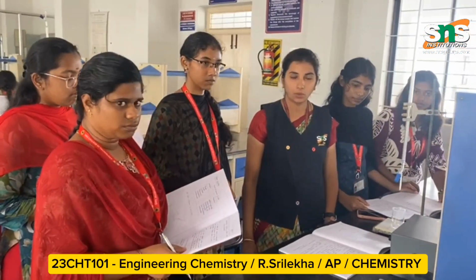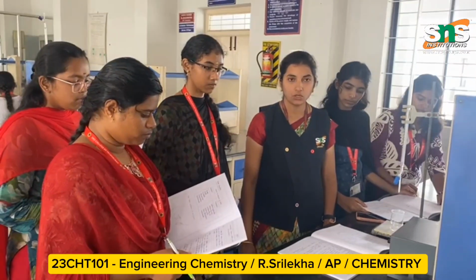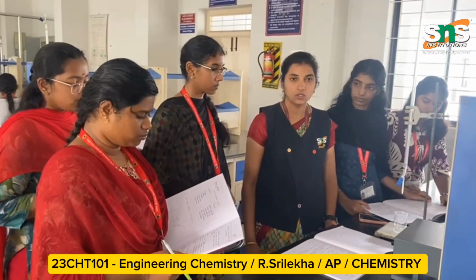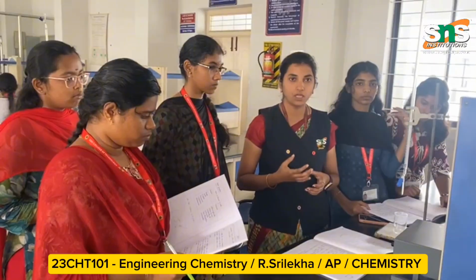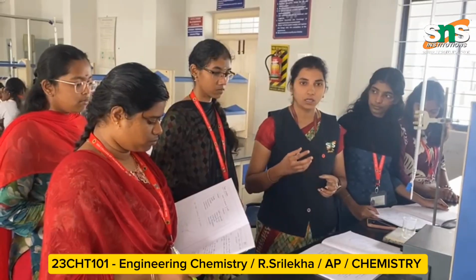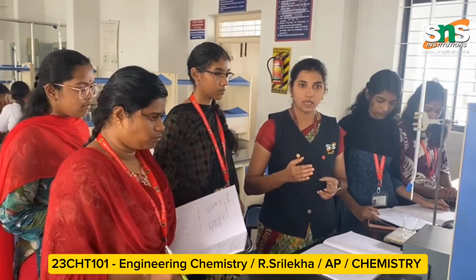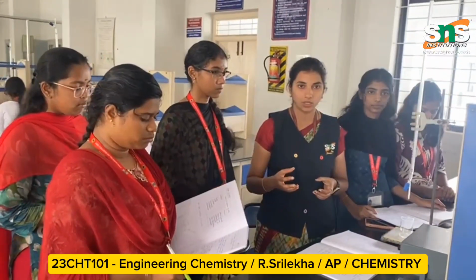Today I am going to talk about the DT based video lecture on the determination by titration of a mixture of acids, using HCl and acetic acid. Here I am going to cover the types of mixture of acids. We are going to take two types of acids, HCl and acetic acid. These are combined and titrated with NaOH solution.